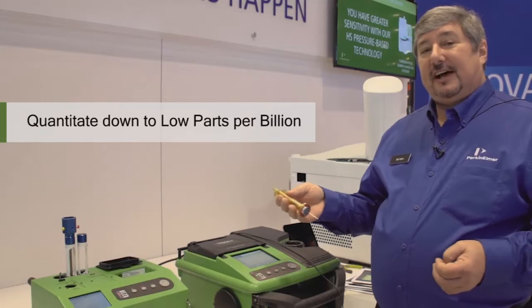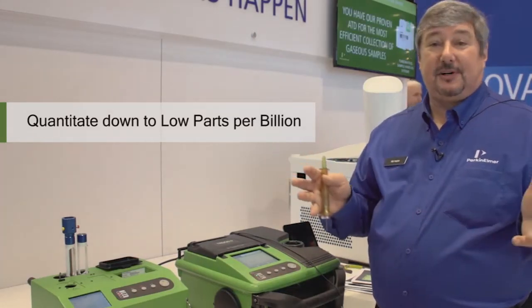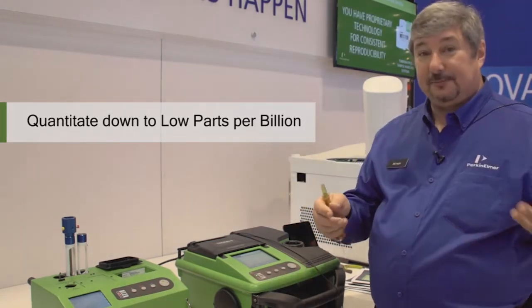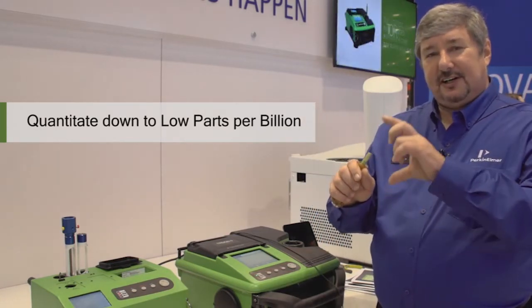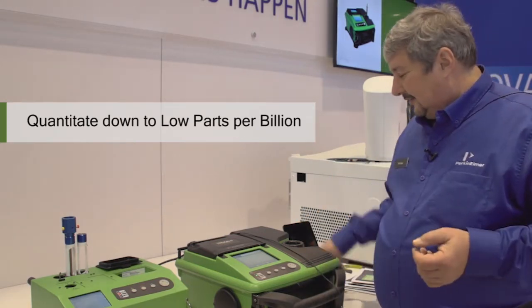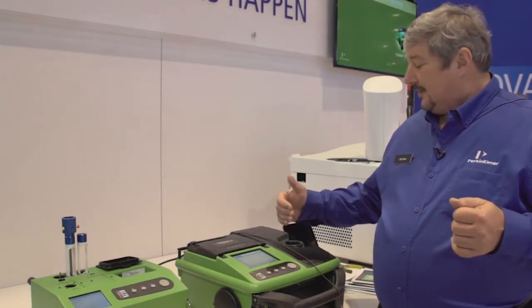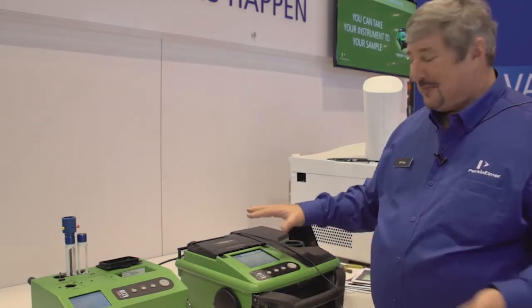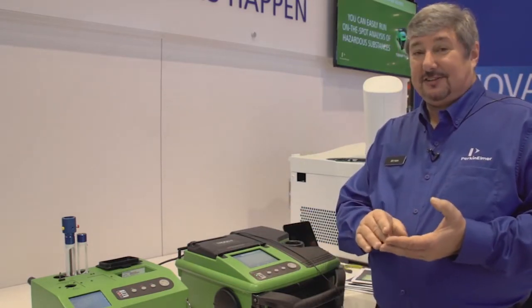SPME fiber allows me to measure headspace of different items, especially if I wanted to look at groundwater samples and measure things like gasoline in there, looking for BTEX. Low parts per billion — just exposing the SPME to the headspace of even a 60 milliliter vial and then analyzing on here. My retention times are measured in seconds. This is actually a three minute run, which is longer than I usually go — it's usually a two minute run. My peaks are about one second wide, but I can still get 10 scans across it.